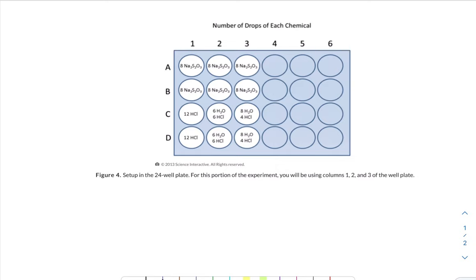Double check with your instructions the number of drops of each chemical. This is what we currently have, and you're going to put these drops in the spot plate in this order. You must measure the drops very carefully. I'm looking for about the right answer. There are, for example, eight drops of Na2S2O3 in this spot, eight in this spot, eight in this spot, etc. You'll notice you're keeping the amount of Na2S2O3 the same in all of those spots, but you are changing the amount of HCl.